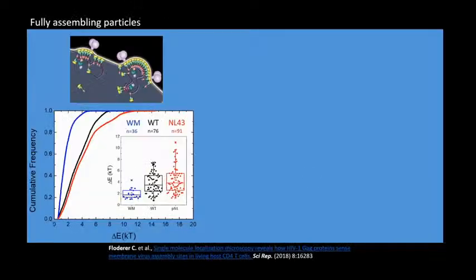By monitoring the changes in this attraction energy during the time course of assembly in living cells, we tried to decipher the contribution of each component involved in the assembly. Interestingly, we observed that a mutant of Gag-Gag interaction considerably decreased this attraction energy as compared to the wild type, while the addition of the viral RNA into the cell did not change significantly this attraction energy, meaning that the self-assembly can occur independently of the presence or not of the viral RNA.